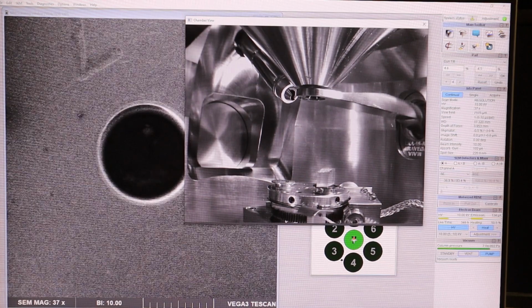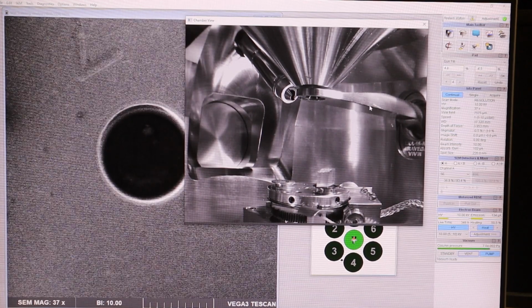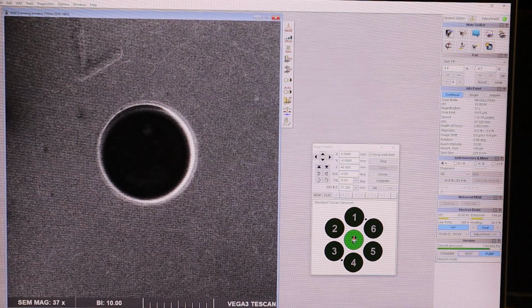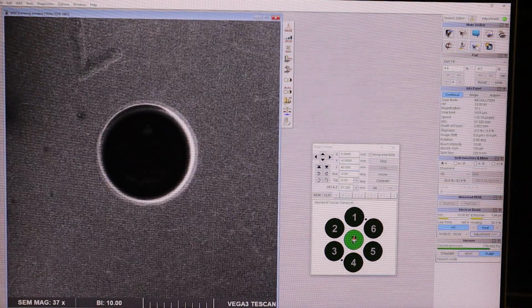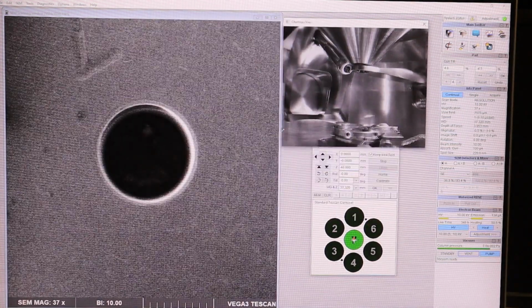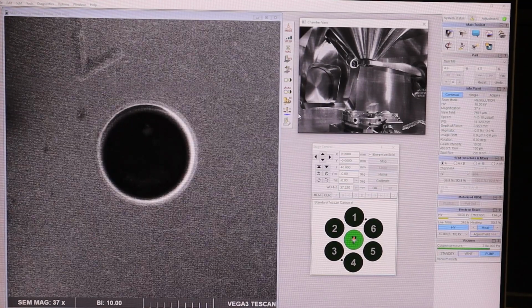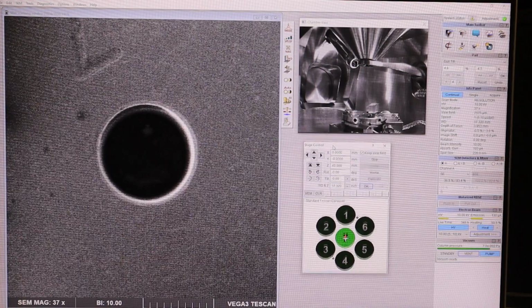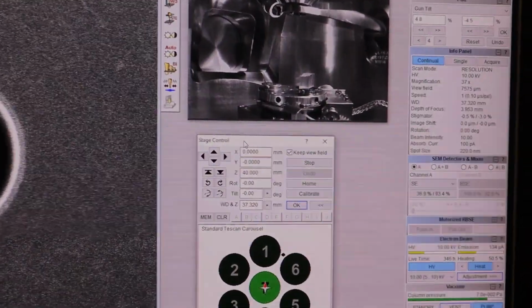If you are ever moving the sample around physically, moving the stage, you should have this infrared window open. If on the off chance it is closed, we can reopen it with these buttons on the top right. So the little camera window reopens the infrared view. But if you're ever moving the sample, we should have this camera on just to make sure we don't hit anything.